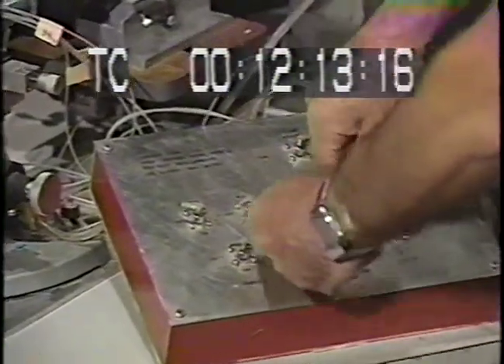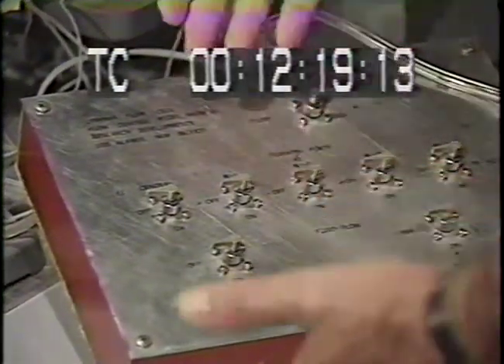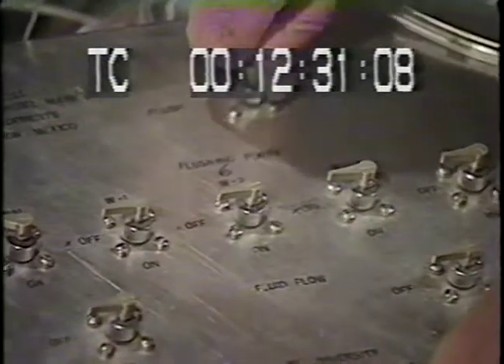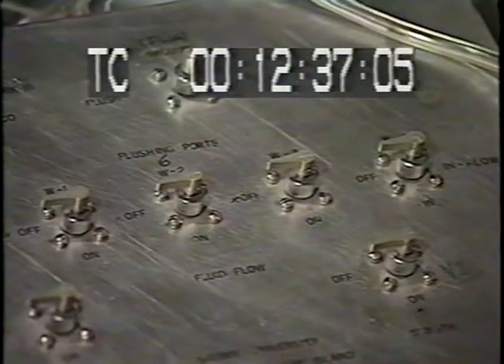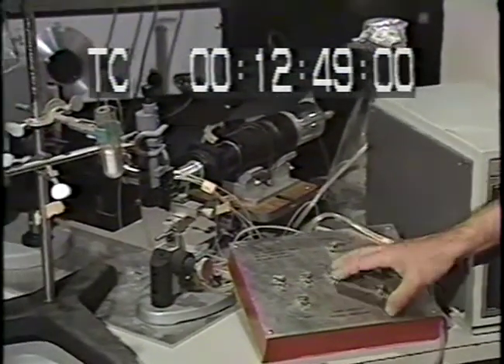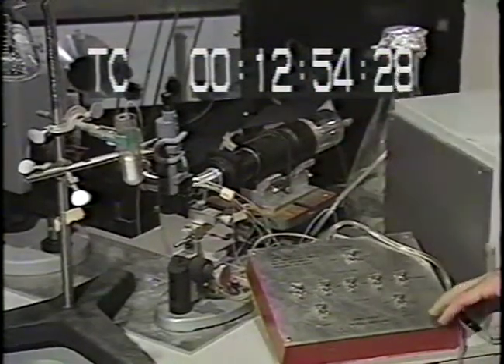bubble. And some people were better than others to use the instrument. One of my technicians will come and say, I can't get rid of the air bubble. So, oh, well, you have to go first on the central, wait a few seconds, turn it off, and go with the vacuum a little bit. And so this was the fun part of the instrument. The focusing was the most difficult thing. But then for day-to-day use, the operation of the water and the vacuum was essential.